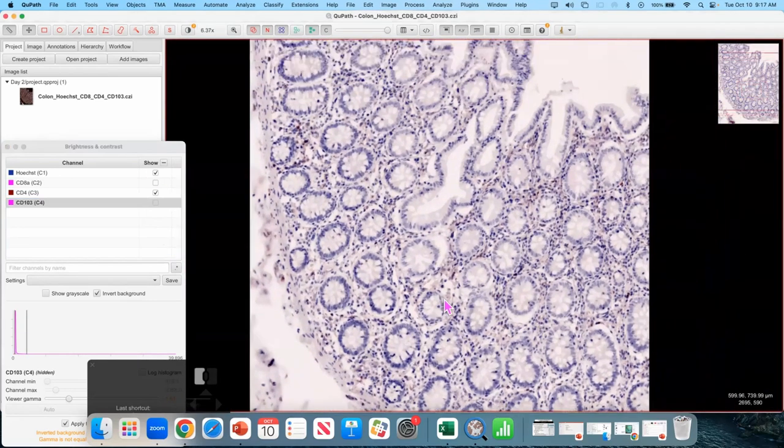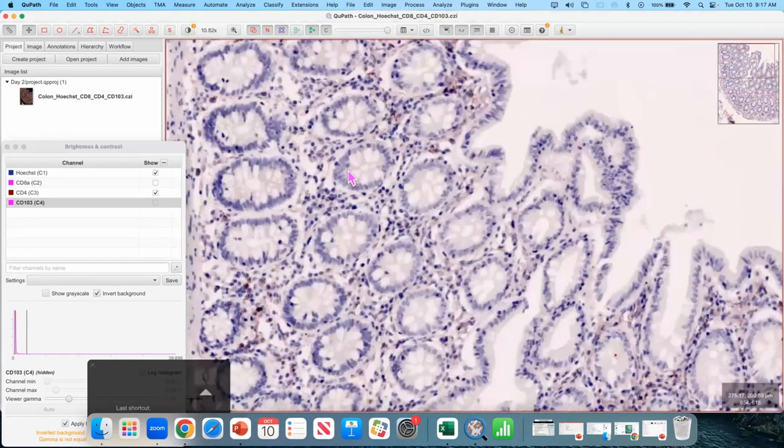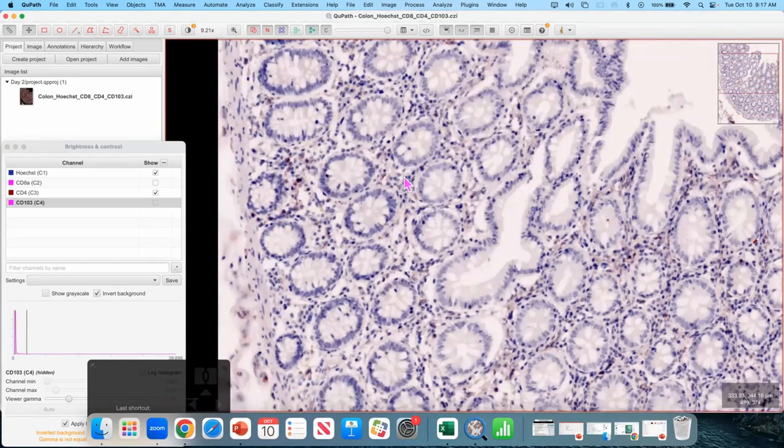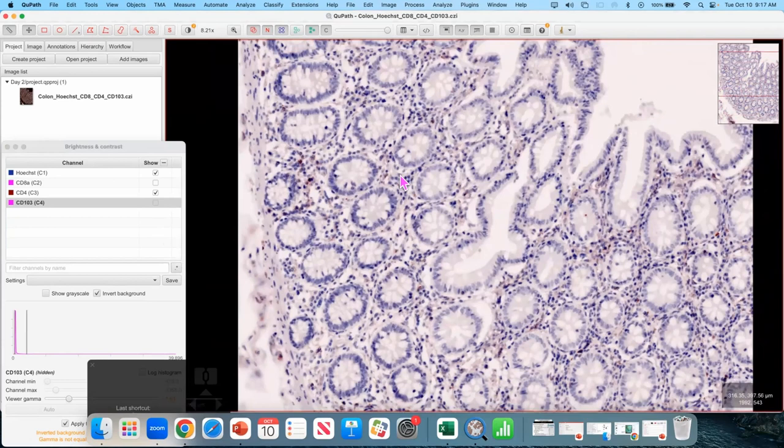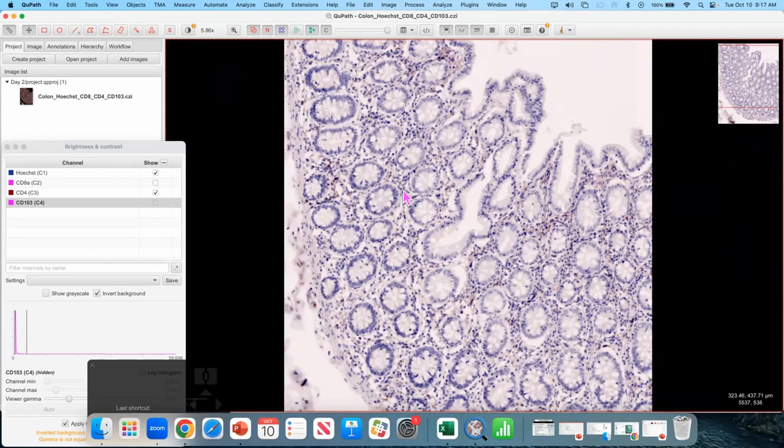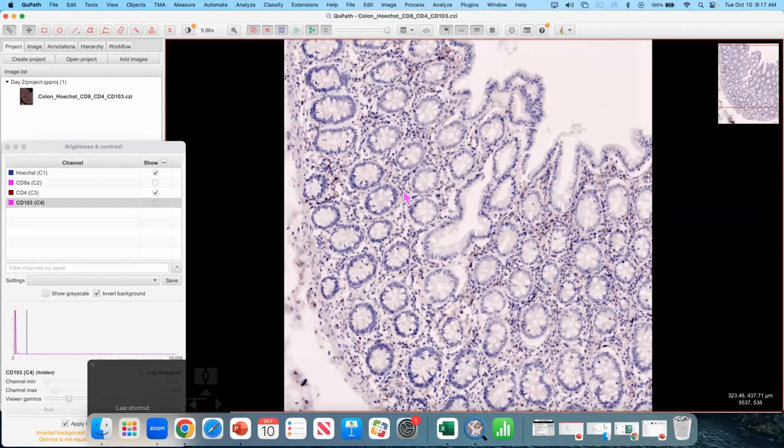And now that I've totally messed up the color table, this is a section of colon, and it's somewhat of a tangential section, unlike the Swiss roll that you saw yesterday. If you took my scalp and you had a piece of my scalp here, and then you sectioned it this way, then you would see all the hair standing straight up. But here, you're not seeing hair standing straight up. You're not seeing the microvilli and the crypts kind of line up. So what this is, is it's kind of a tangential section. You're just getting kind of some cross sections of crypts.